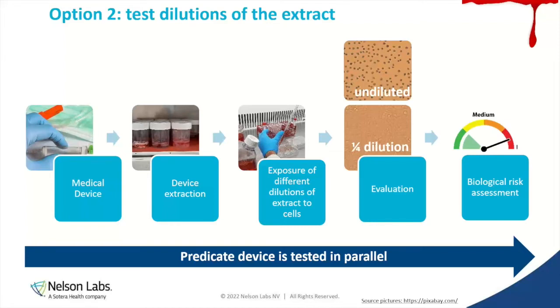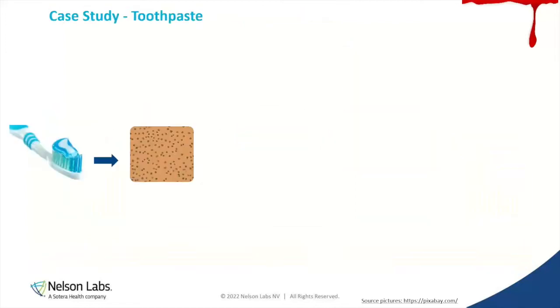Yes. So this is an interesting case study because it's about a product line, actually. So different components within this product line. There are some toothpastes that are being designed as medical devices for the way that they're treating gum and oral issues. So that makes sense. But when you try to put it in a cytotoxicity test, it's going to fail for an abundance of reasons, not just one component, but just the very nature of toothpaste. This very sensitive cell culture system is not going to love that very much.